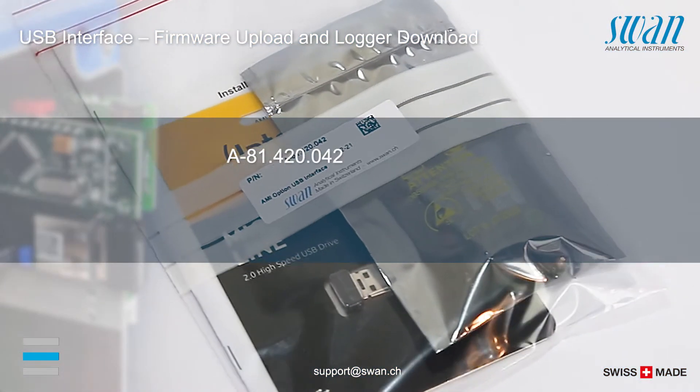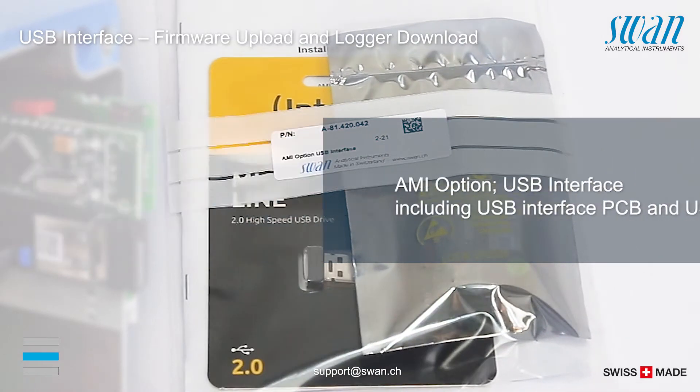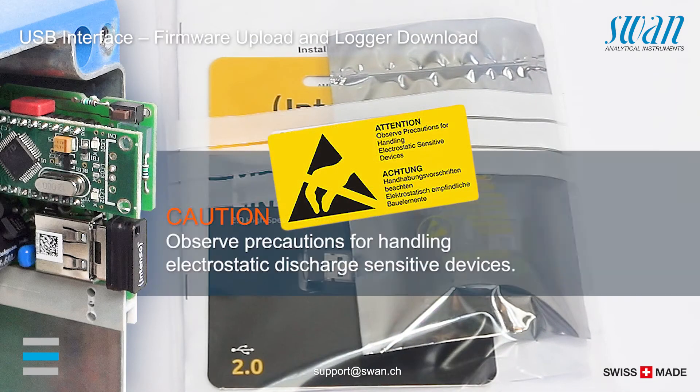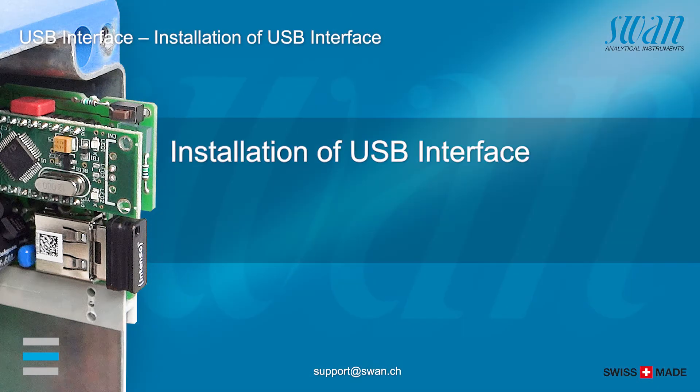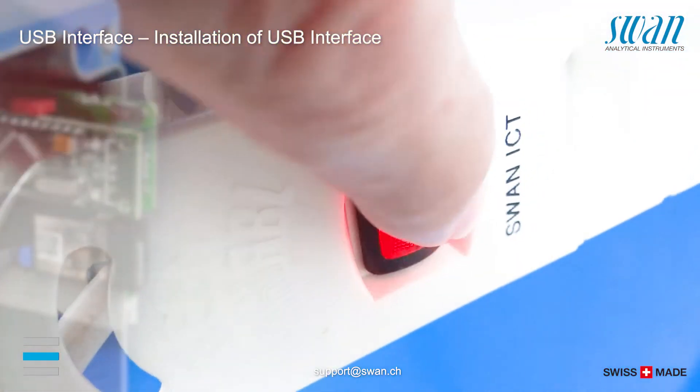The following communication option is available. To install the USB interface, switch off the power and open the transmitter housing.